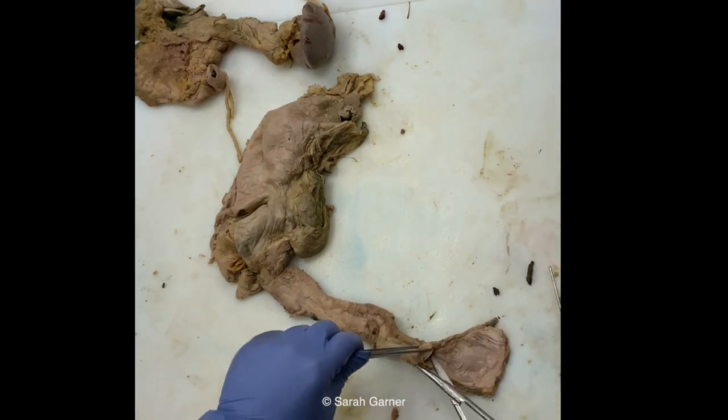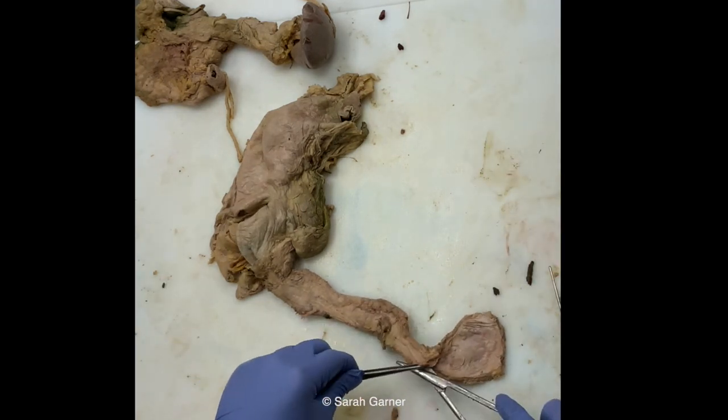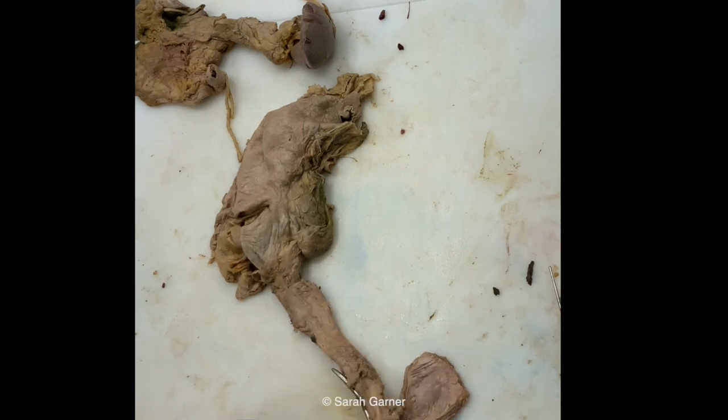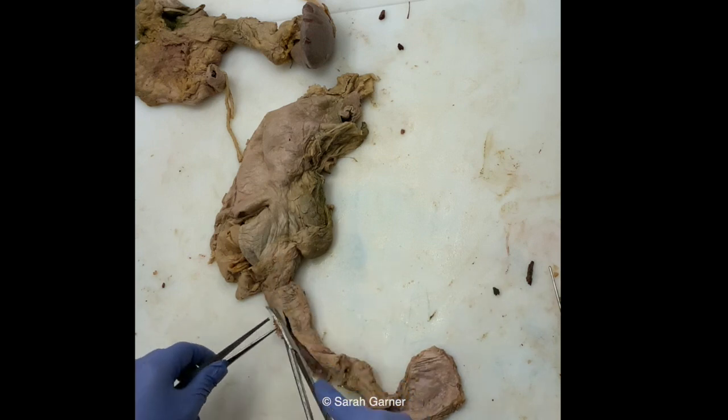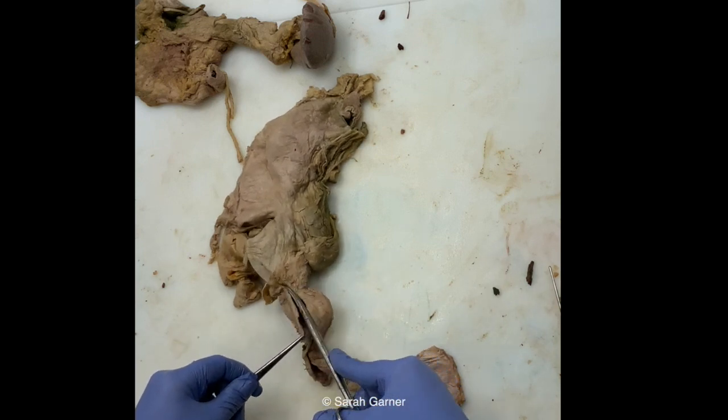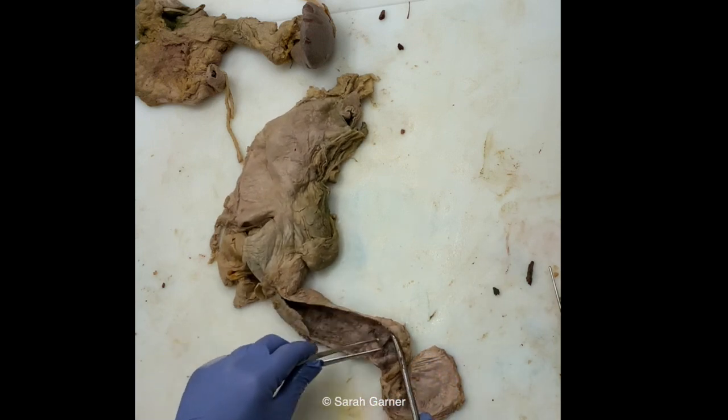So with the esophagus, unless there's some sort of esophageal pathology that you're looking for, like say there was a tumor, you'd want to cut around that, but otherwise it doesn't really matter where you're cutting it as long as you're opening it and inspecting the full thing.